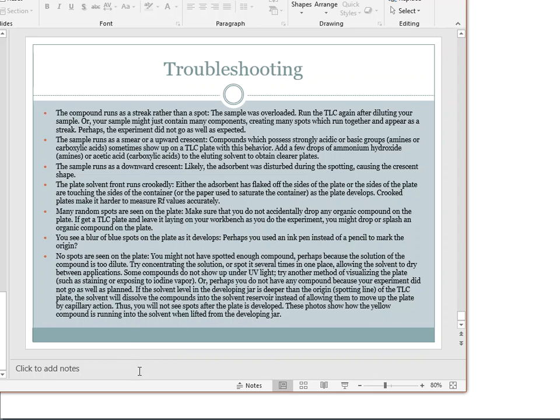So this concludes our speech on TLC. Very simplistic technique, a very simple technique that we do for prep work, though. We don't really do quantitative work with it at all. So in organic chemistry, you probably will do some TLC slides. You will do some TLC slides with us as well, just because we introduce the concept and we talk about it in chromatography. But, you know, other than one lab, you're basically not going to do any more TLC work with us at all. It's just really that. Just because it's not a very common technique that goes forward in a chromatography lab anymore.